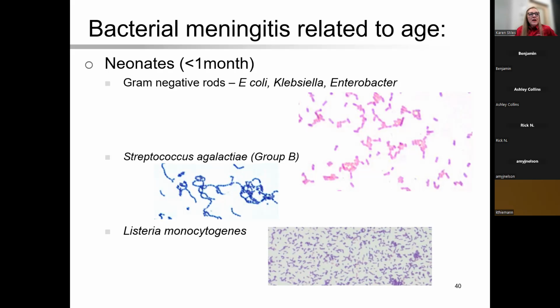That's a very good point. In fact, you can take it one step further and make them go through the whole reference box and then start picking through already previously read gram stains and ask them to read those as well and check their results against the results of the previous report. So very good point. Other questions?